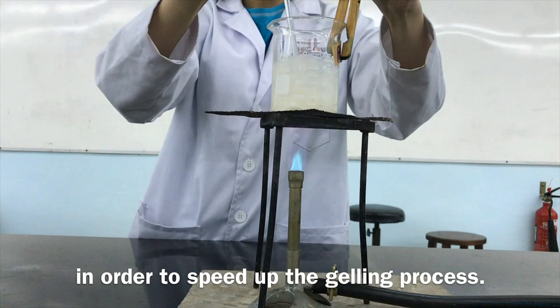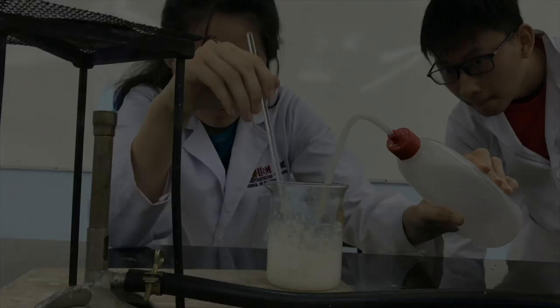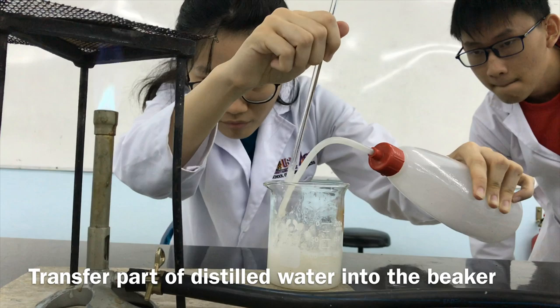Transfer 15ml of glycerin into the beaker, portion by portion with continuous stirring. Transfer part of distilled water into the beaker until the calibrated mark is reached.